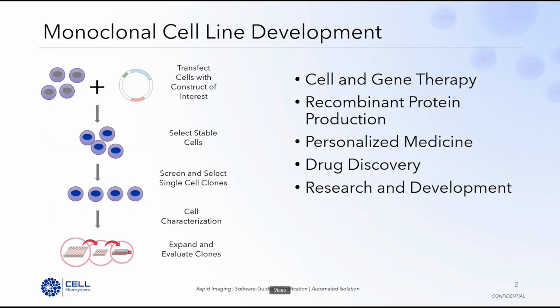If you're joining us today, I'm sure you're familiar with this process of monoclonal cell line development, but it really is the cornerstone and foundation of a vast array of research and development efforts, including cell and gene therapy, recombinant protein production, personalized medicine, drug discovery and toxicology, and generalized research and development for discovery.